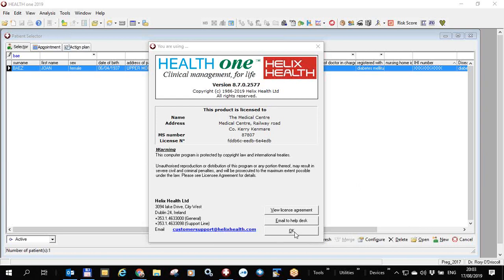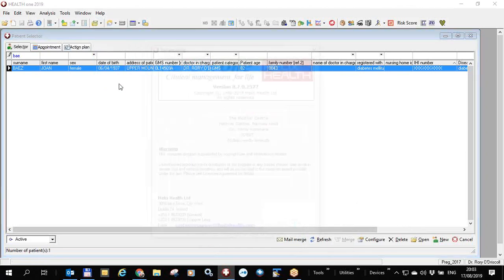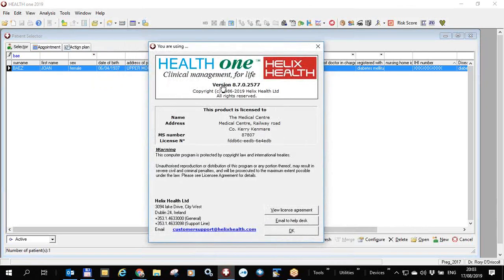In order to see what version of Health One you have, you should click on Help and About, and you'll see over here the version you have. This will be distributed in the next few weeks. This particular video is going to show you some of the changes we've made to the lab request and lab managing systems.